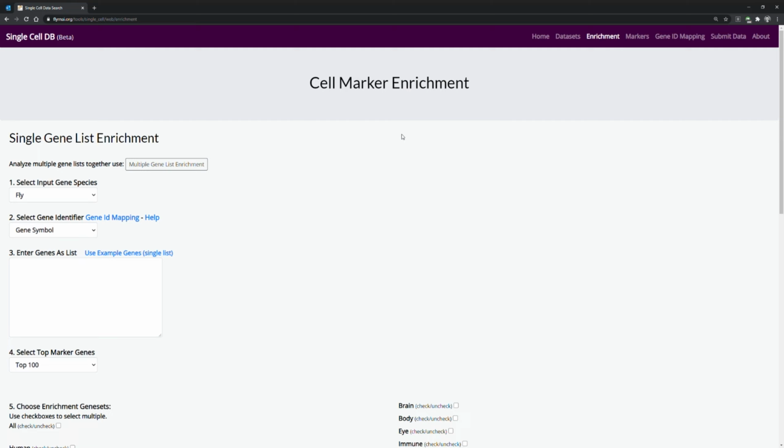This could be useful if, for example, you're trying to identify the most relevant tissue or cell type from an input list of hits from a cell-based screen, for example, some fitness genes, and this would allow the user to design an in vivo experiment accordingly as the next step. Users might also use a list of genes from a particular group, for example, transcription factors, in order to identify the transcription factors that are expressing in the tissue or cell type of interest for a follow-up study.